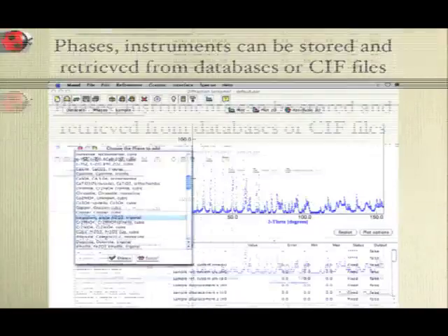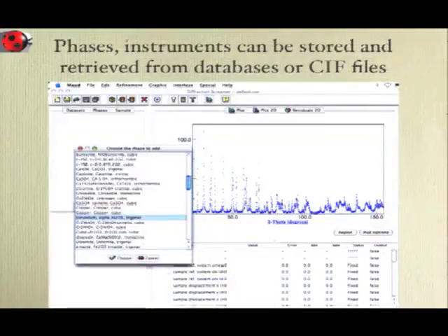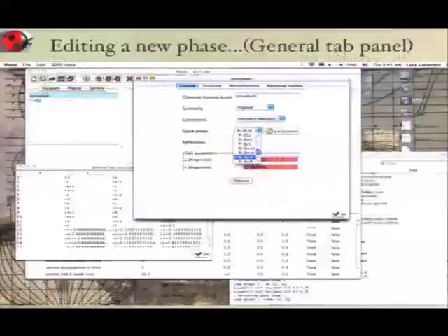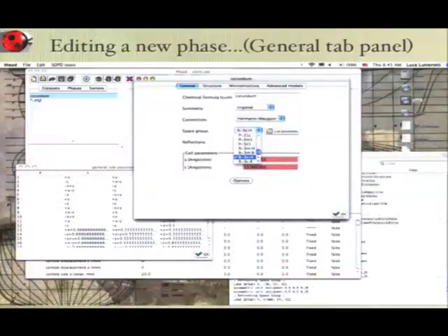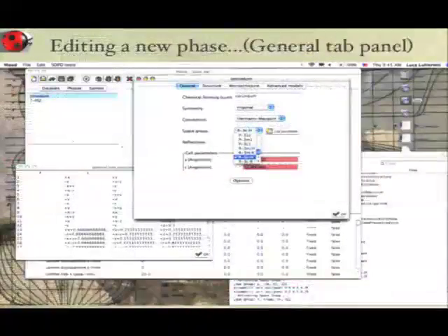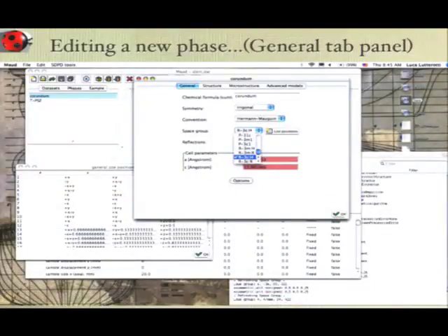Okay, so normally, how to load data? The preferred way of the material scientist is just to get a CIF file and load it. Otherwise, you have to input by hand, okay? And second, when you load the CIF, check what has loaded, because sometimes there are several CIFs. In some CIF, there could be some error, or sometimes it's just MAUD that makes an error and doesn't recognize some of the CIF, okay? So you check especially the space group, if it is recognized correctly, the set parameters, and the atom positions.